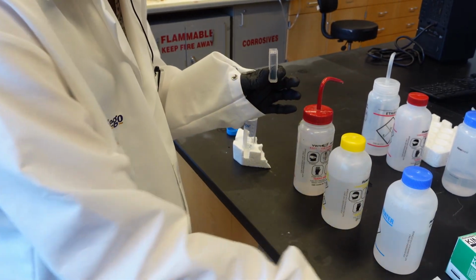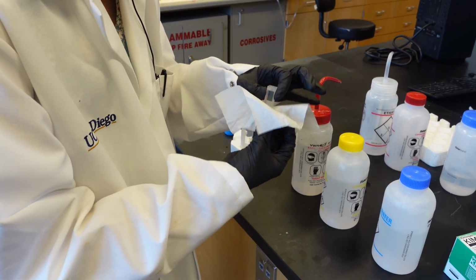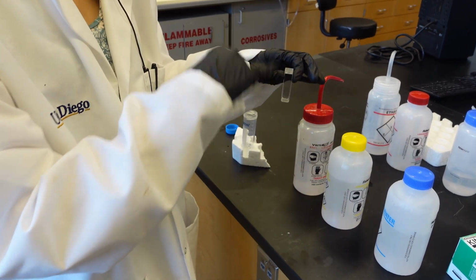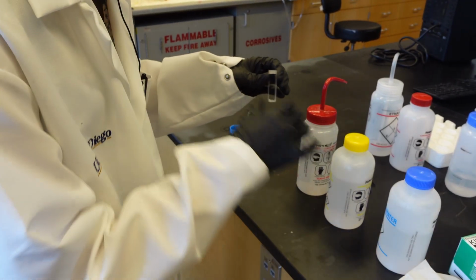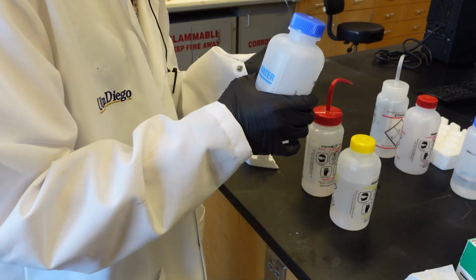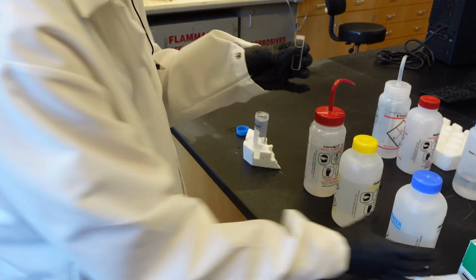So once you've done that, you'll want to wipe down the sides with a chem wipe, the clear sides, and then from there you can fill it up with your buffer solution, and then we'll load it into the instrument. We're just going to use some water, and then just make sure it's filled at least halfway.